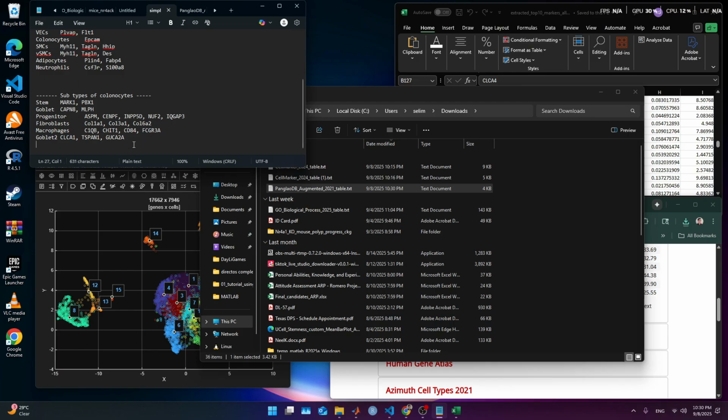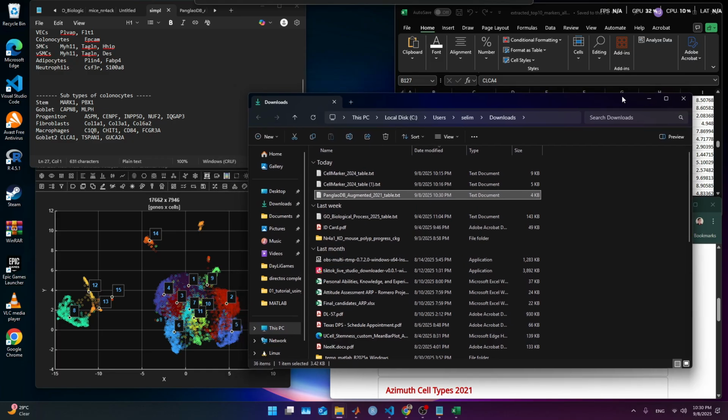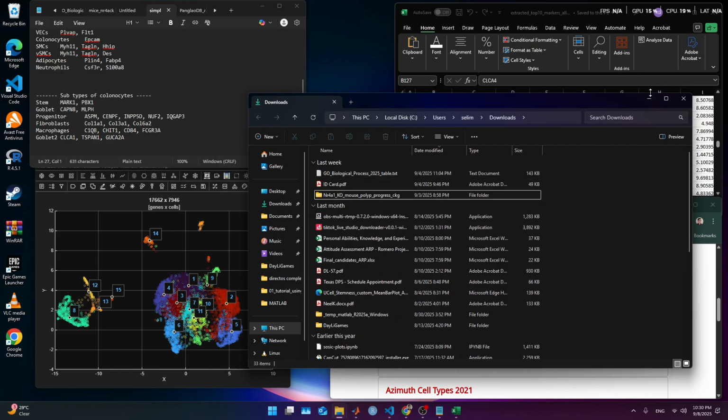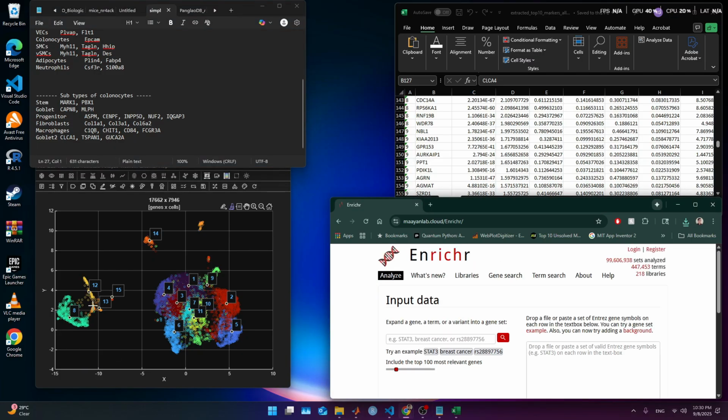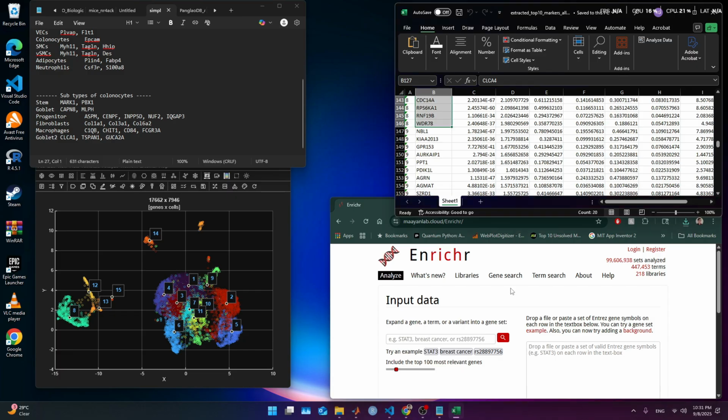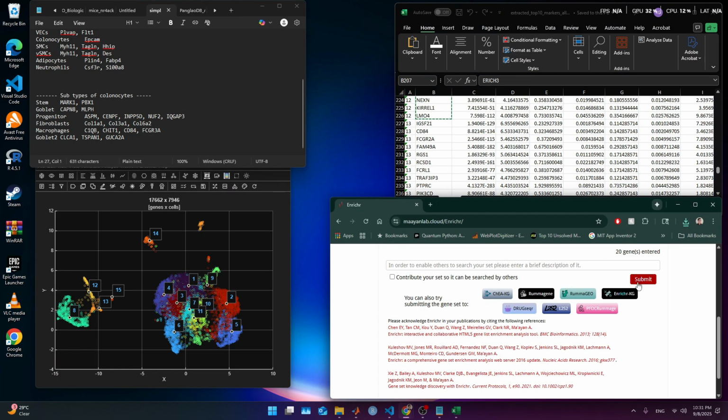We are gonna keep it like that for now because I think those are a little different genotype. So now we are gonna clean these others and we proceed to look at the other. Let's look for 12. This one's not so sure. Let's look.